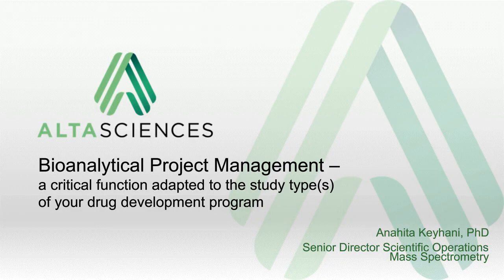Today, I will discuss bioanalytical project management. I will review selected critical control points and the framework and information transfer for successful progression of the bioanalysis within the drug development program. Given my background and experience, the presentation has a CRO perspective and examples are from mass spec.